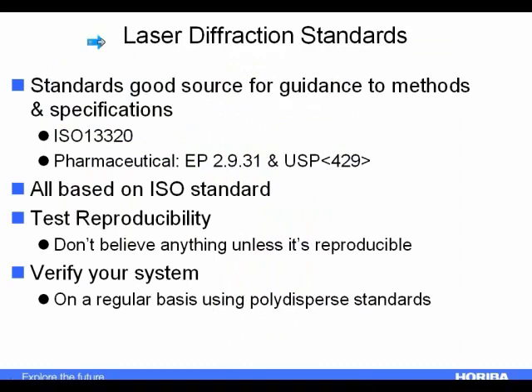Once again, we should also look at what standards exist in order to understand how to properly set specifications. In the laser diffraction world, we have ISO 13320, which is applicable to all industries. And in the pharmaceutical industry, if you're on my side of the pond, we use EP 2.9.31, and if you're on Ian's side of the pond, you use USP 429. They're essentially the same standard, the same document. They're both based on ISO 13320.